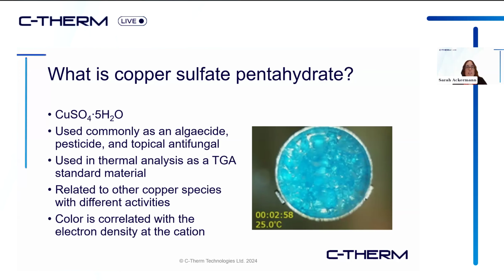But it's also commonly used as an algicide, pesticide, and antifungal. The other thing to note, one of the reasons why people prefer using copper sulfate over some of the other common TGA standards like calcium oxalate, is that copper sulfate has these pretty blue crystals, as opposed to some of the other materials which tend to look like a fine white powder, and that can make for some uncomfortable discussions for the installation technicians if they're in an airport, for example. So it's easier to explain a blue powder than a white one.